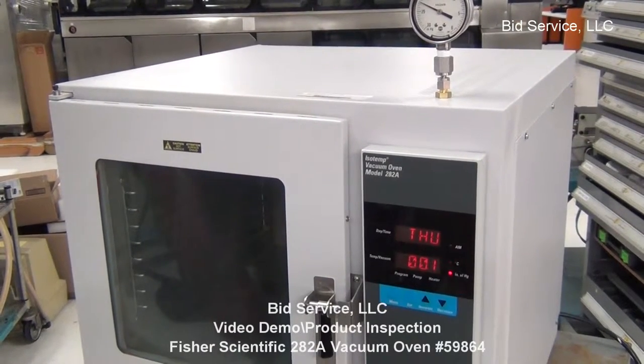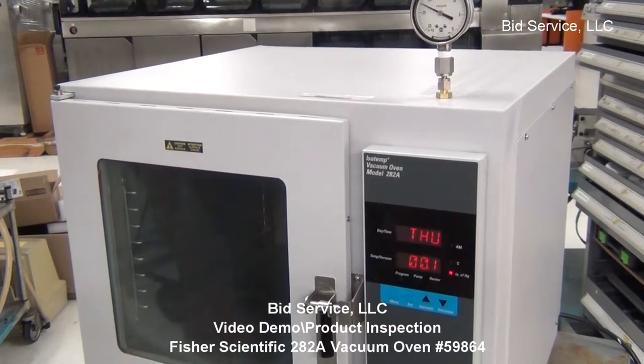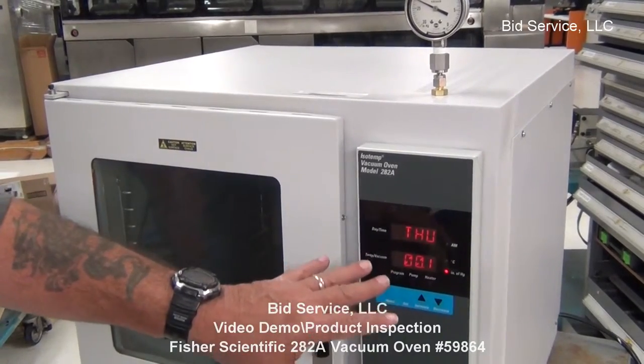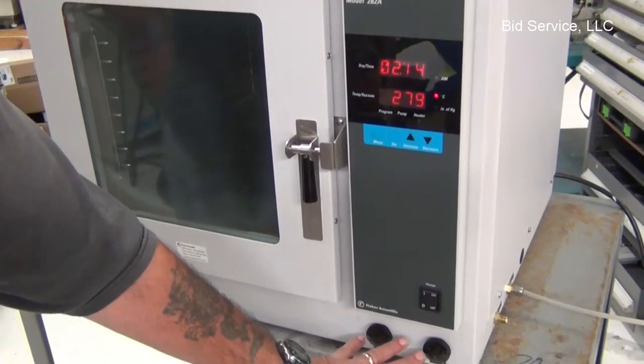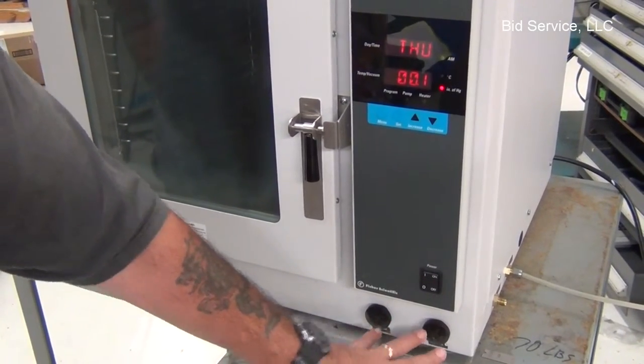This is the Fisher Scientific Model 282 vacuum oven. The display is here. On and off switch here. Vent and vacuum, or purge and vacuum, are here.